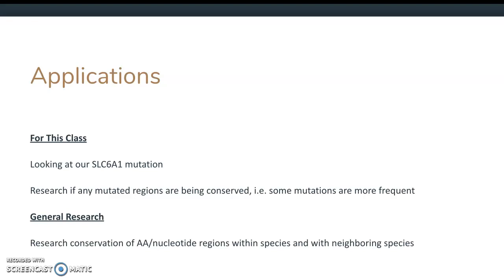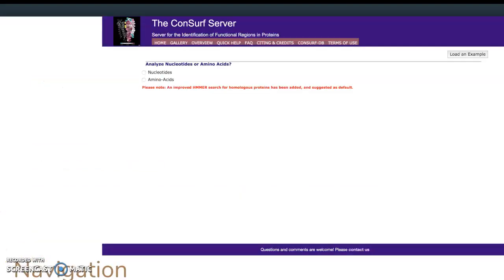It has applications for general molecular biology research. You can use it for studying conservation of amino acid and nucleotide positions from an evolutionary standpoint. In this class's particular case, we could use ConSurf to look at the frequency of our SLC6A1 gene, which is what we've been looking at all semester. We could potentially pick a nucleotide sequence and run its frequency against all known mutated versions of this gene. But because there is no current model in the Protein Data Bank of SLC6A1, I will be using the example that was generated for me for the rest of this presentation.